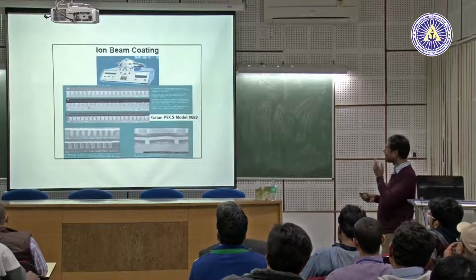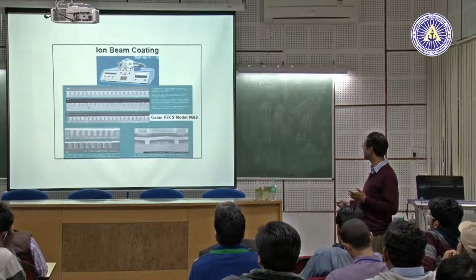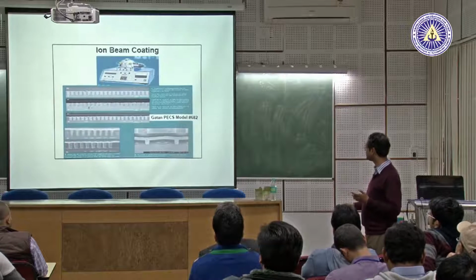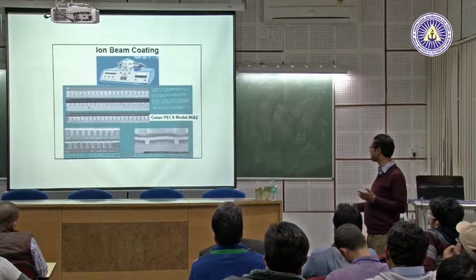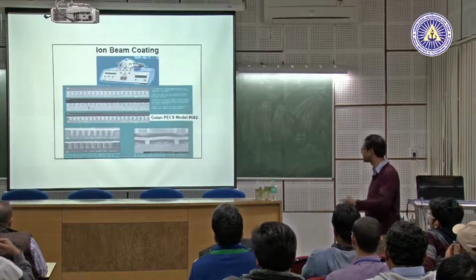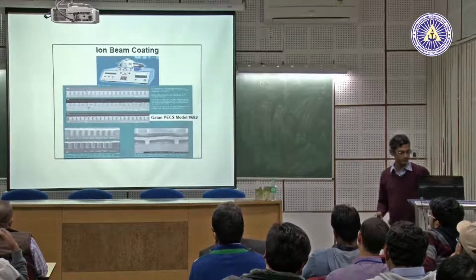Correct. So these are all the coatings done on the sample. You can see here that these are coated using a machine, and then you can clearly see the image. The difference between this and this is there. Here you don't see the things there. What is inside this white layer? But here you can see clearly. Even the grains can be seen.